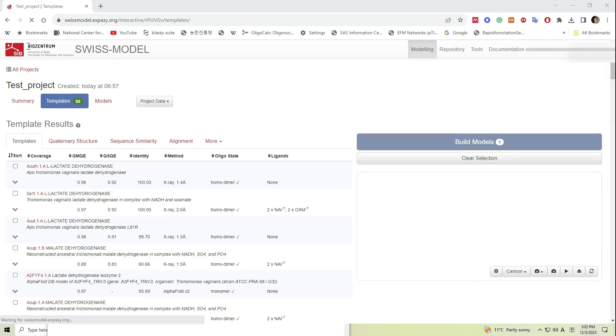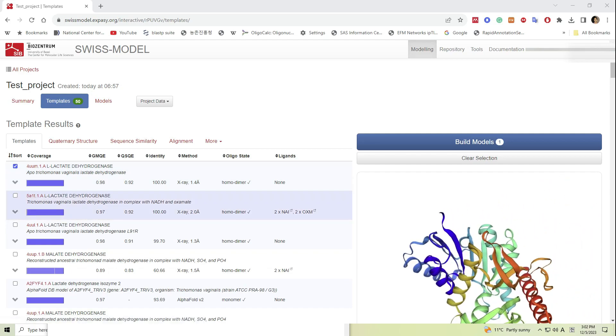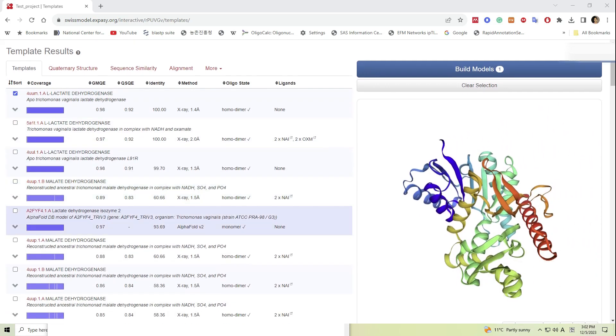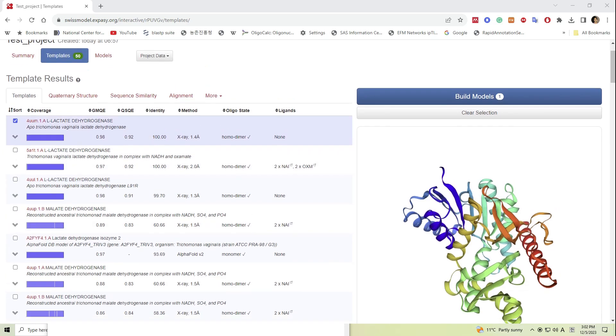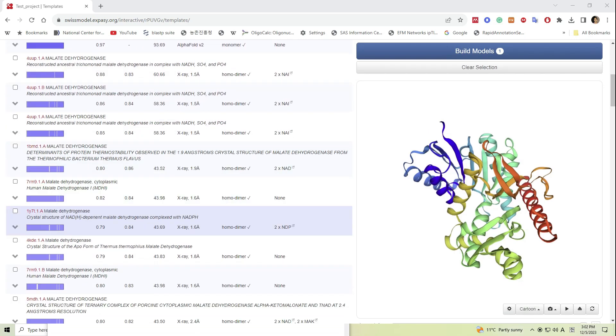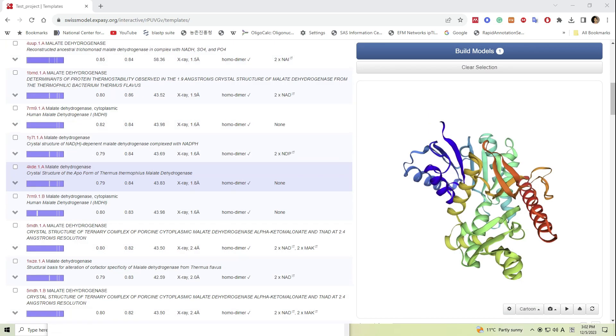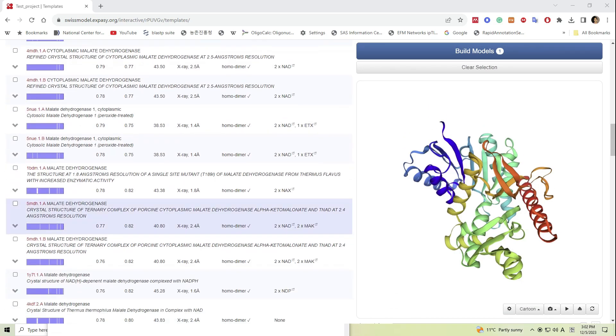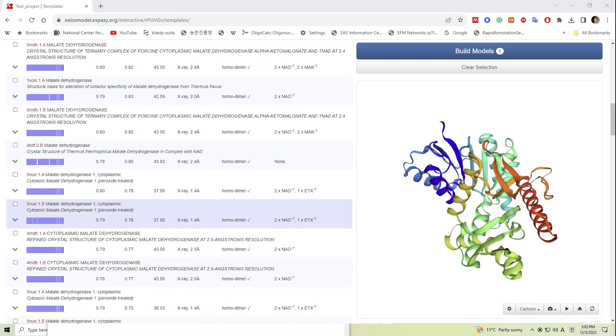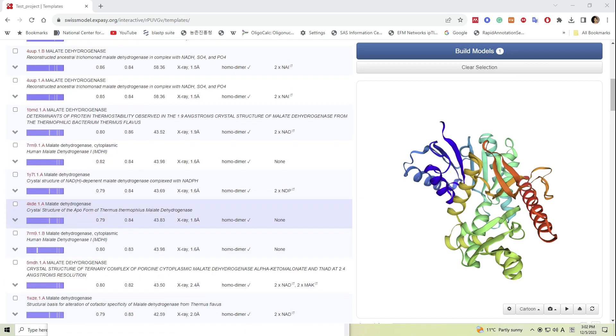After the analysis is done, several templates are listed and we have the freedom to choose based on sequence coverage, global model quality estimate that is called GMQE, and quaternary structure quality assessment that is called QSQE.